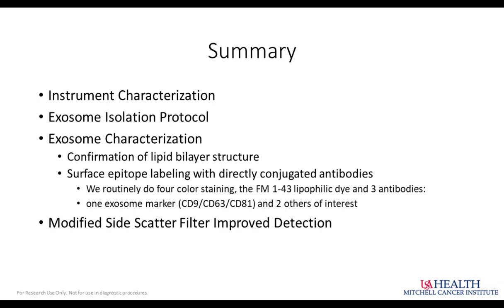First question is, what are the challenges of using polystyrene beads and silica beads as size standards? So, you know, I hate to patently endorse one product over another, but Apogee really is the only company offering these small silica particles. There is a vast difference between the refractive index of silica versus polystyrene.